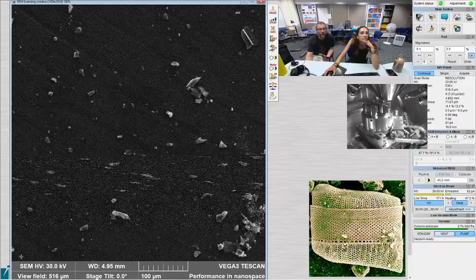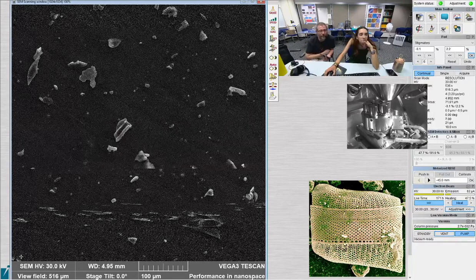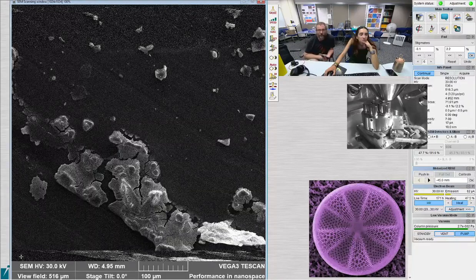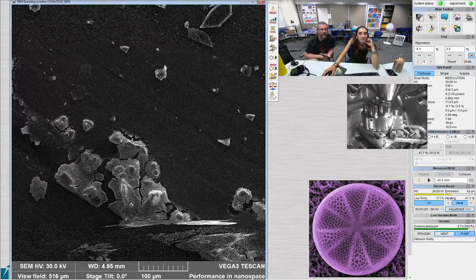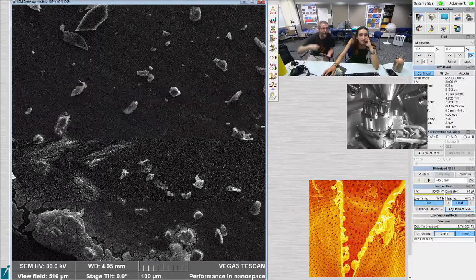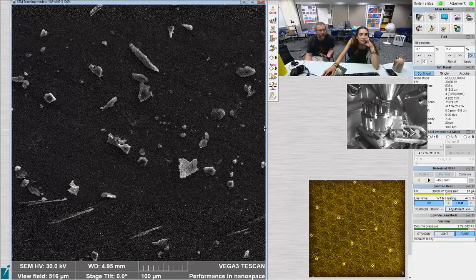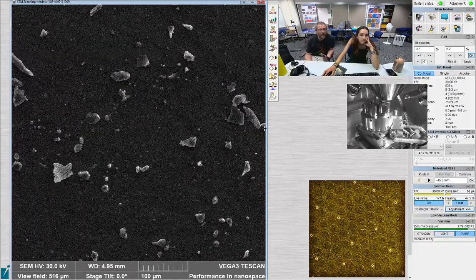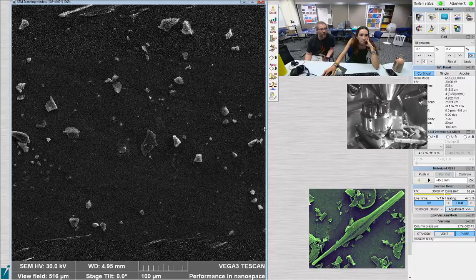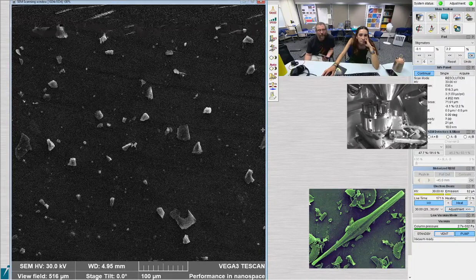There are some students who are going to use it this summer to look at fish otoliths. They've collected some ear bones out of fish from the Wabash River. The ear bones in fish are called otoliths, and they have annual growth bands on them, like a mollusk or a tree or corals that make annual growth bands. I think they're going to do some elemental analysis on each growth band to try to see, each year, if there's any evidence of contamination in the water that would have been integrated into the fish's ear bone. But I don't know how likely that is to produce solid results, and I don't know what kind of contamination they're looking for. It could be mercury, it could be lead, it could be something a little bit more common.